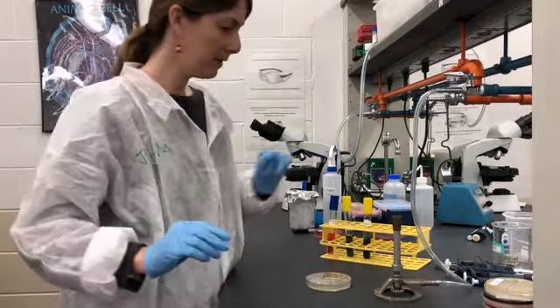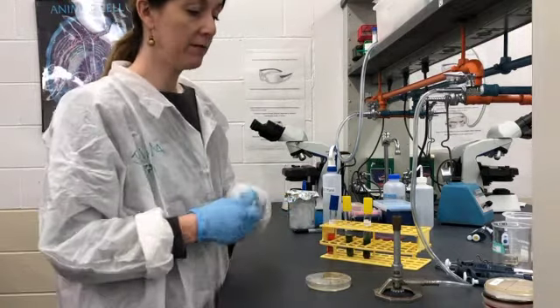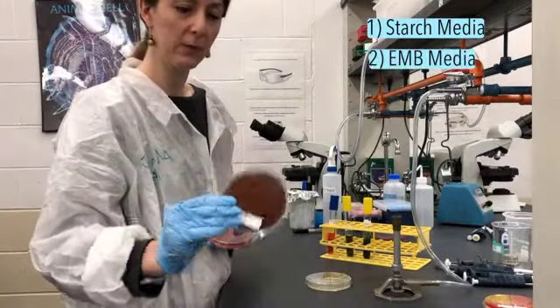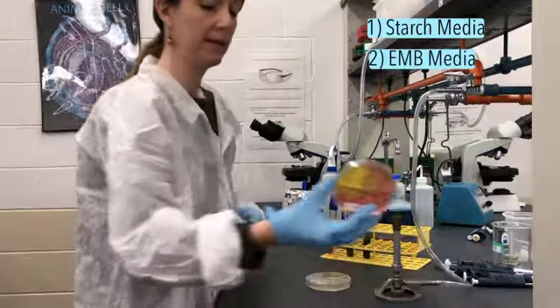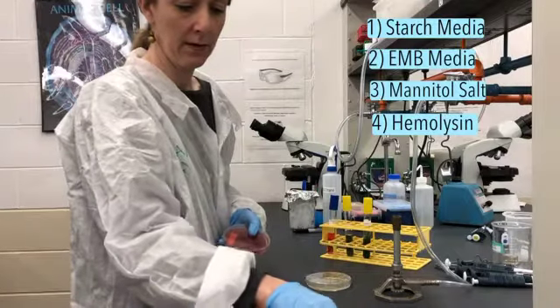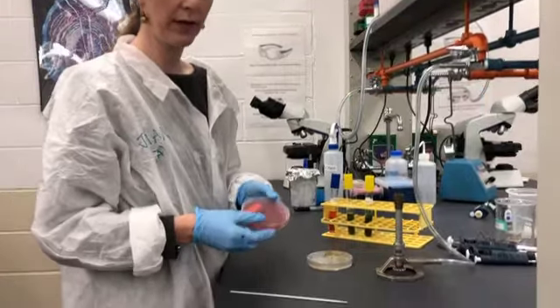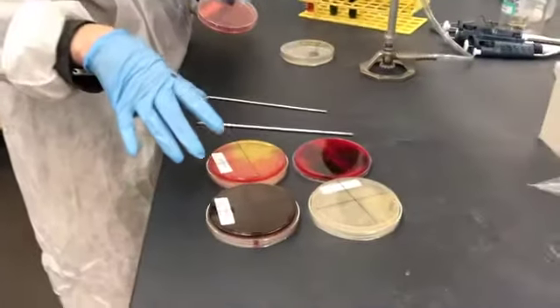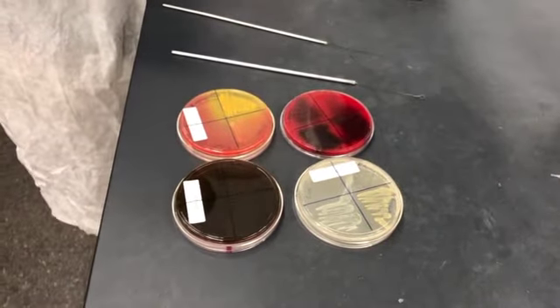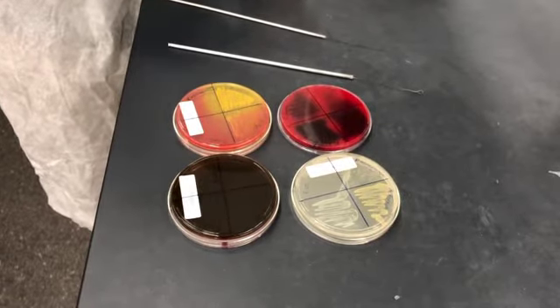Last, we are going to be using several types of media this week that have different properties. So we'll have the starch media, we'll have the EMB media, which has this purple color, and we'll be using the mannitol salts and even the hemolysin. So you're going to be using all of these in addition to a nutrient agar plate. The goal of the nutrient agar plate will be to ensure that your bacteria is growing. And for all of these, you're going to be inoculating bacteria on these plates in the same way.